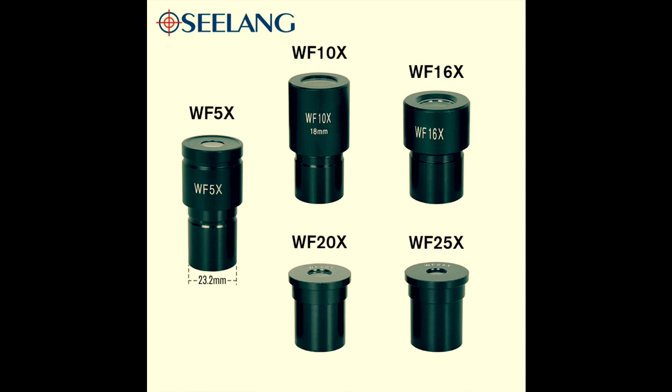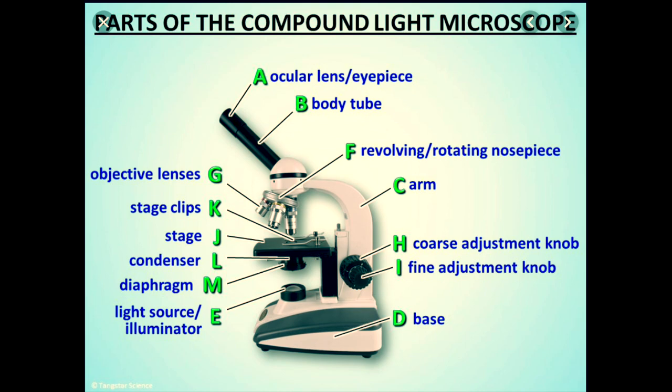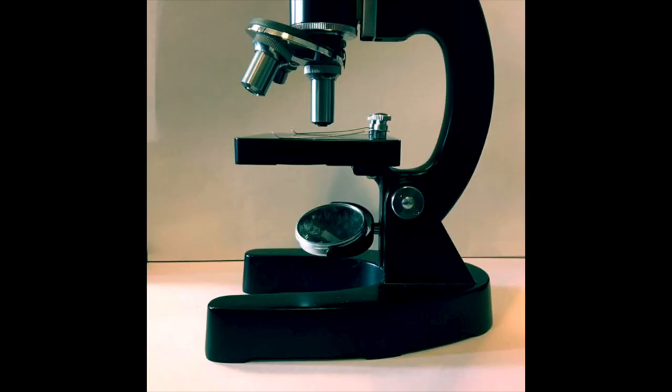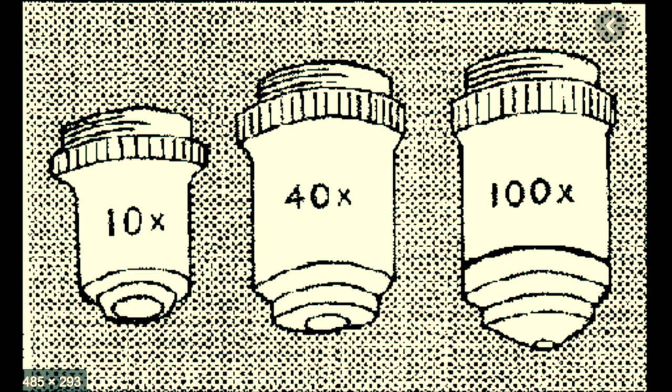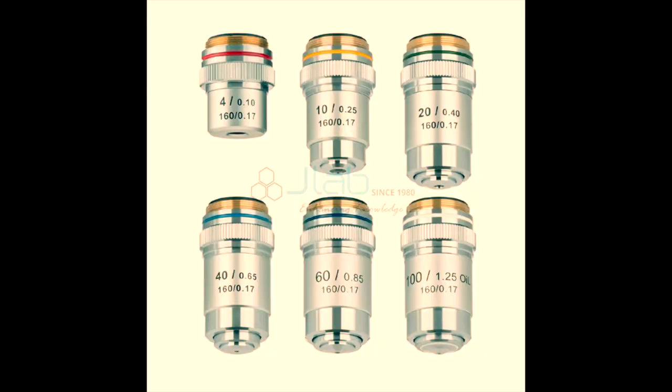Moving on to the nose piece which holds the objective lenses. This is how the nose piece looks like and the objective lenses attached to it. These objective lenses are of majorly 3 powers, 10, 40 and 100x but may also have other powers like 60 and 20x.